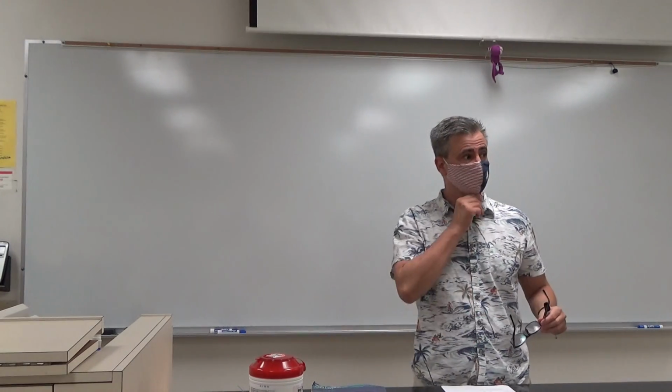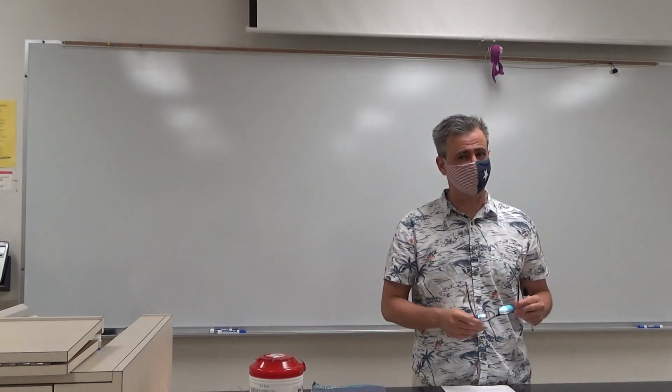Today we're going to do an elimination reaction.